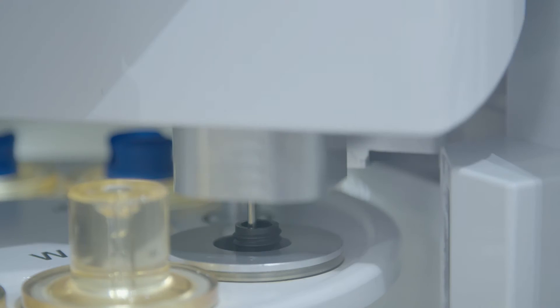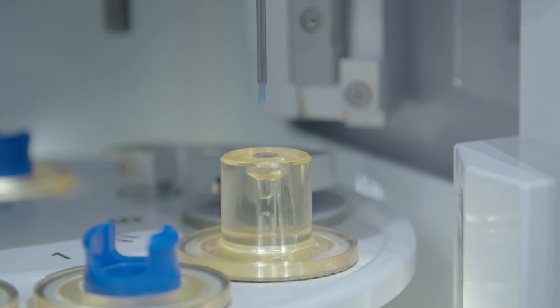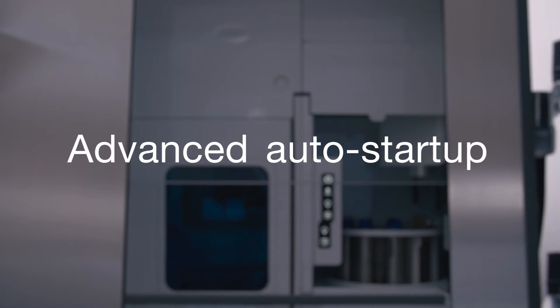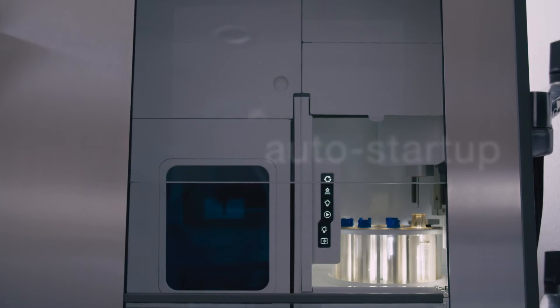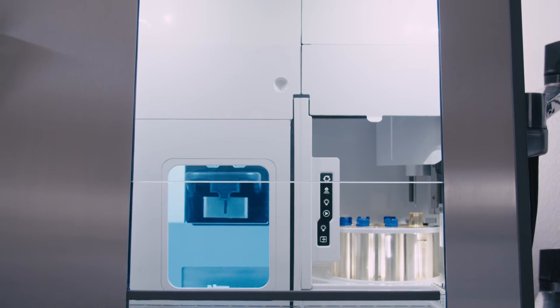With onboard beads, start-up, quality control and drop-delay are all fully automated processes, reducing instrument setup time. Auto Startup can be enabled the day before, which allows the Bigfoot Spectral Cell Sorter to turn itself on at the designated time without anyone in the lab.